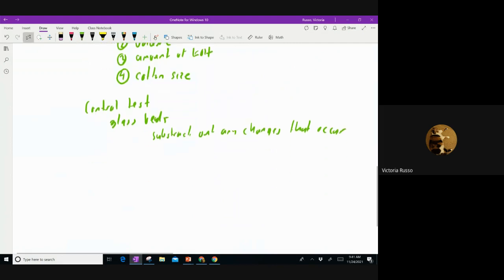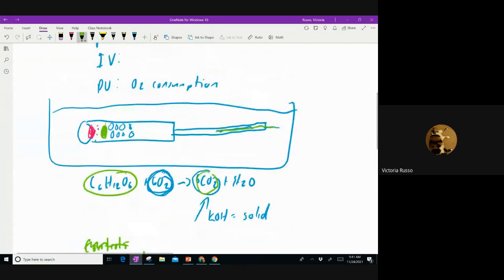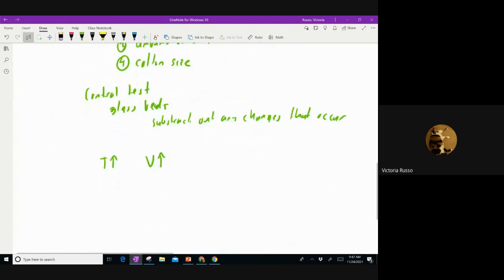And so to understand what changes might occur, you need to know some gas laws. There's a gas law that says if you increase the temperature of the environment, then the volume of a gas will expand. And if that happens in our experiment, if the temperature changes while we're doing the experiment, the oxygen gas here is going to change and kick water out, and you're going to see the numbers start to become negative. The other thing that could affect a gas is pressure.